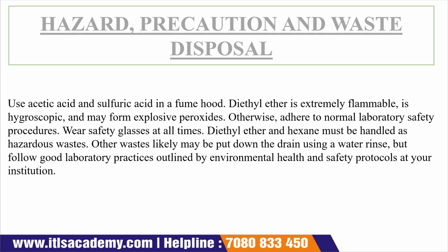And diethyl ether and hexane are hazardous waste. So when we are handling them, we have to take extra care, and the waste produced by these chemicals should be discarded as hazardous waste, and other waste should be drained out with a water rinse. And along with it, we also follow the good laboratory practices outlined by our environmental health and safety, and the protocols given by our institution.